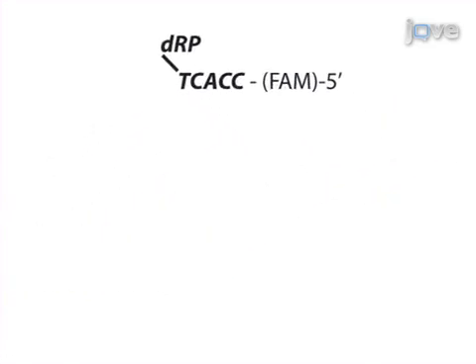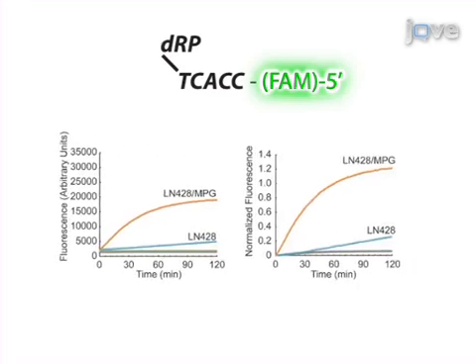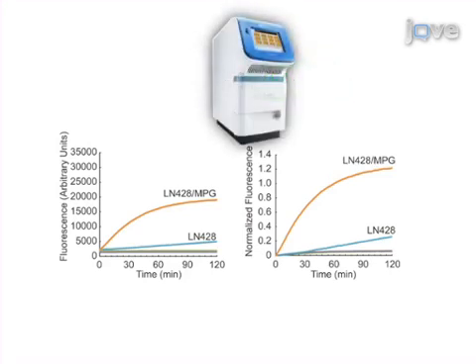Upon recognition, APE1 cleaves the DNA backbone at the abasic site, allowing the DNA containing the 6-FAM to freely dissociate from the hairpin. Detachment from the quencher results in an increase of fluorescence that is proportional to the level of DNA repair and can be assessed in real time using a quantitative real-time PCR machine.